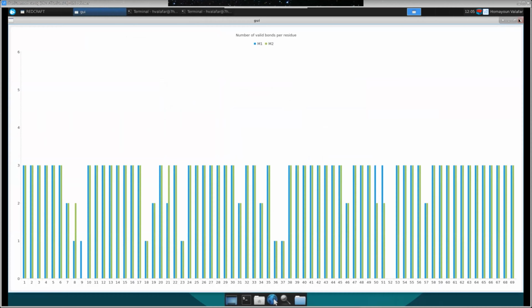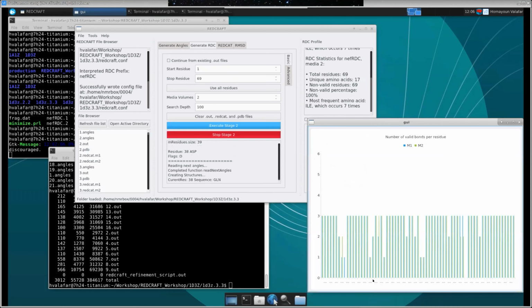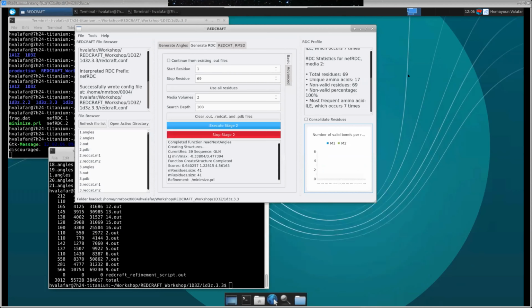So the decimation has a feature that dynamically and adaptively adjusts its depth search to correspond to the degree of data sparseness. So the more sparse data you have, the deeper search it will perform. The more data it has, it will retract to a more shallow search. And then from 9 onward, it becomes less and less. And again, at 12, 13 it kind of jumps back up because of whatever is happening with that data set at 12 and 13. It is complete data, but the data may not be sensitive, might be erroneous. Somehow the algorithm requires a deeper search.